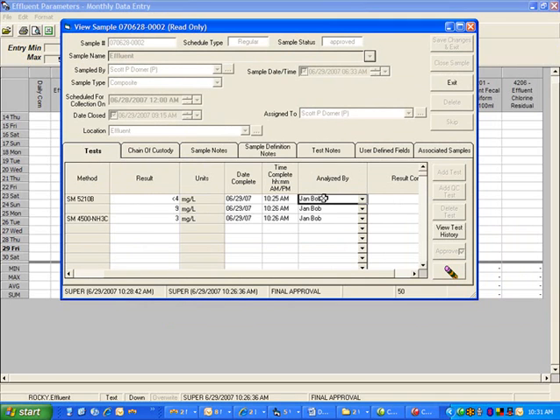Like possibly it's a new guy took the sample, so we're going to want to go interview him and ask, how did you take the sample? What did you do? Did you verify the temperature? Or, all that kind of stuff.